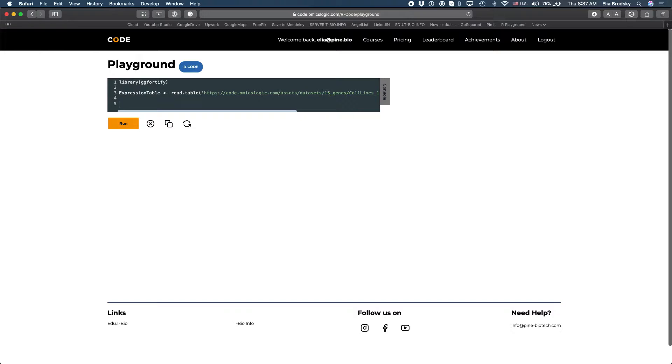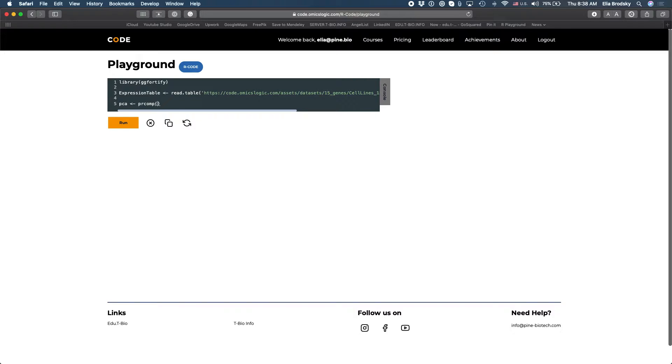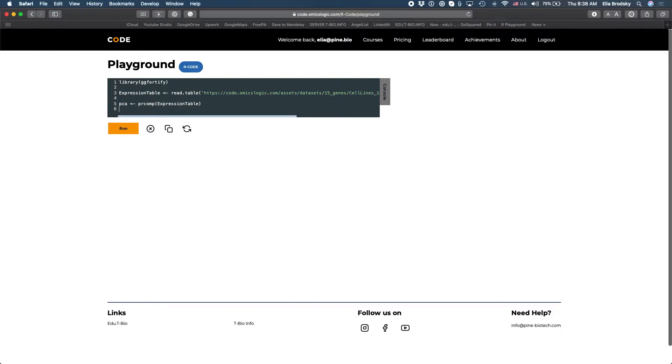Now we can run our principal component so we can do prcomp expression table and we can also plot the PCA so let's try that.